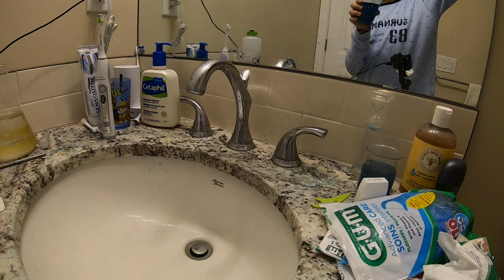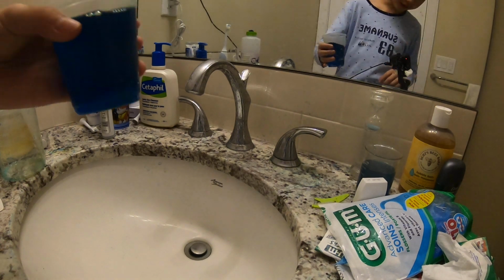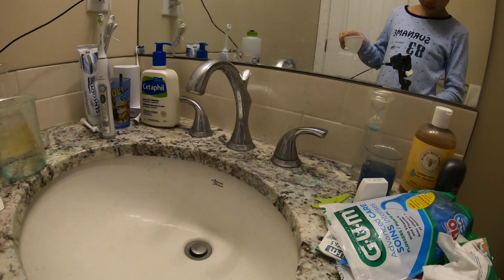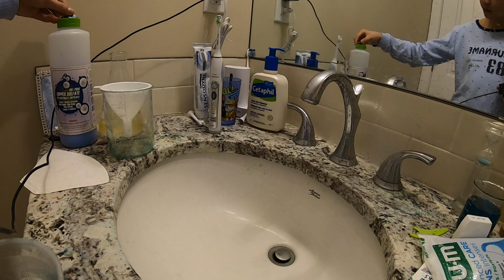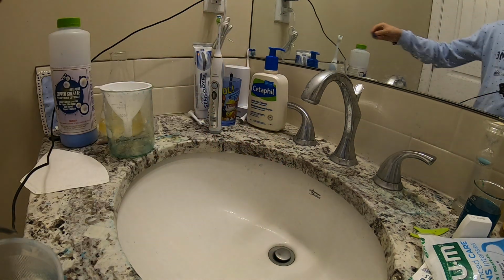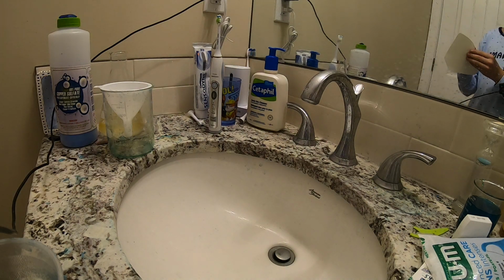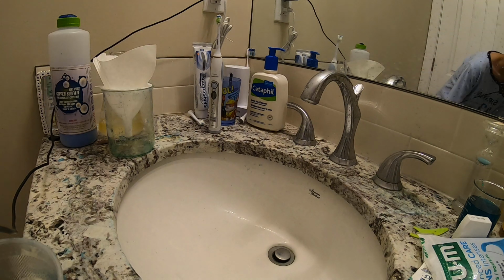Oh well. Alright. So that's as clean as I can get. That's as clean as I can get, like I said. So, rotate this a little. There. So, in there, I'll show you my crystals so far. It's not that big, so plan to let it grow. Take this filter paper, and I'm going to open it up. I'll throw that in there. Push that in. And I'm going to get my pair of gloves.